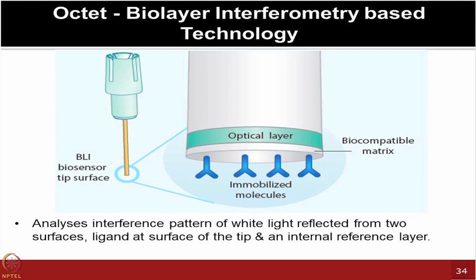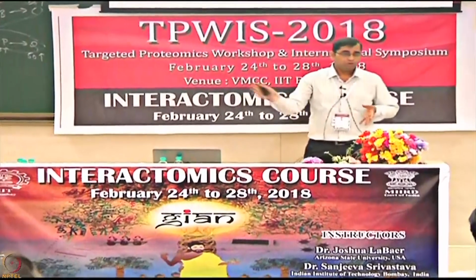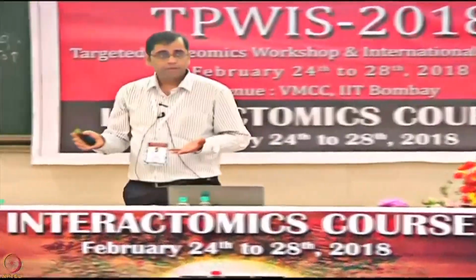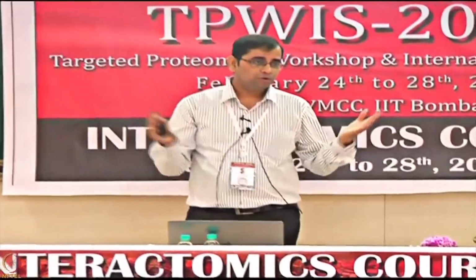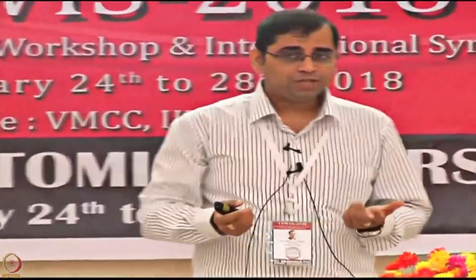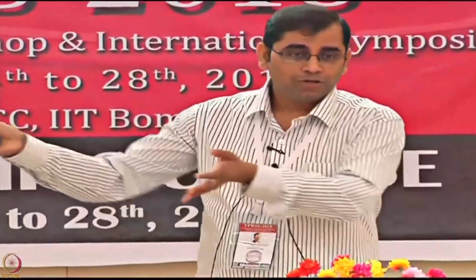We have a follow-up lecture on this, so I'm not going into much detail, but I wanted to give you the feel of in which way you can move forward from different types of platforms. So a good thought can be: from the microarray experiments, you have got leads, let's say 200 molecules which are of your interest now. You can go to BLI to narrow it down further.